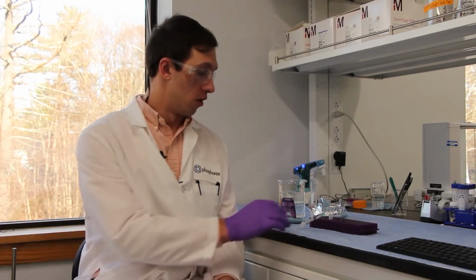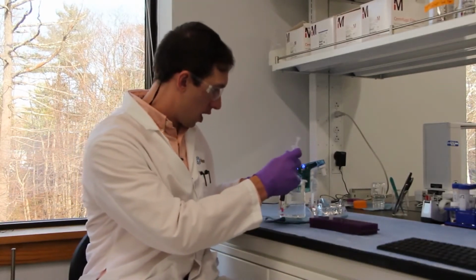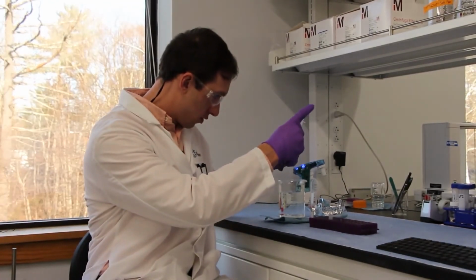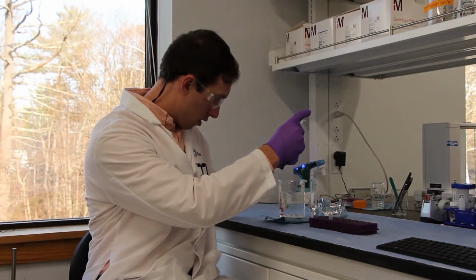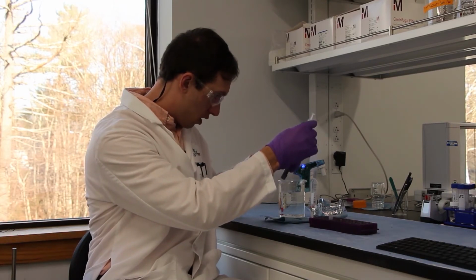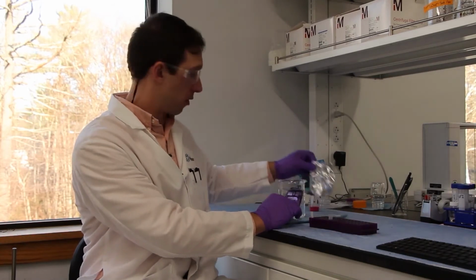At this scale, we typically utilize dialysis to remove our ethanol and transfer our sample into our target buffer solution. So in this case, I've loaded a syringe with one of our four samples. I'm going to inject this into one of our dialysis cassettes. After injecting the sample, we'll remove as much of that headspace as possible before transferring our sample within the dialysis cassette into our target buffer.